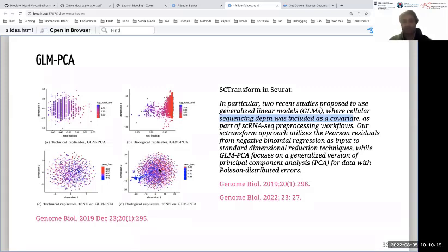And then it's appropriate to use PCA, like this modified version, on single cell data. The common approach is to apply SCTransform, apply PCA, and then apply t-SNE. Because SCTransform gets rid of this artifact of zero inflation, PCA reduces a lot of the noise in your data set, and then t-SNE is useful for visualizing those nonlinear patterns that are often seen in single cell data.